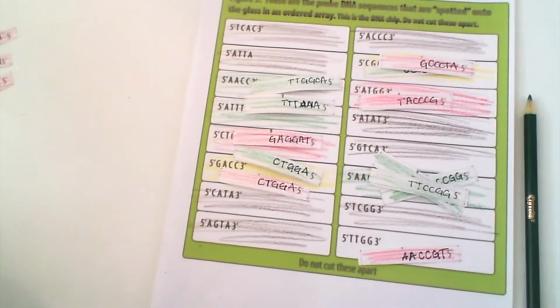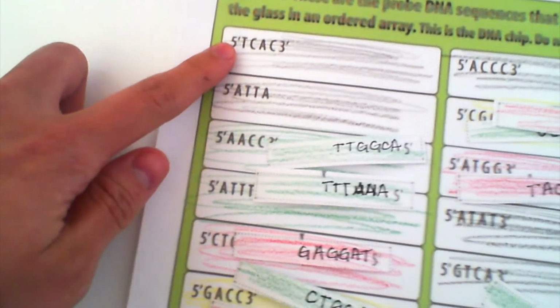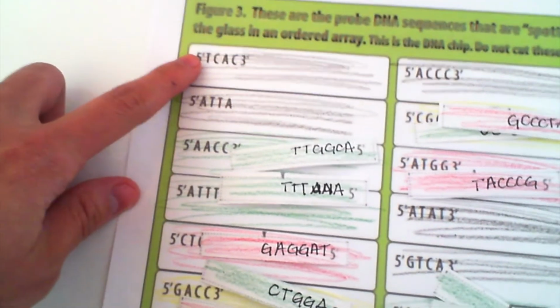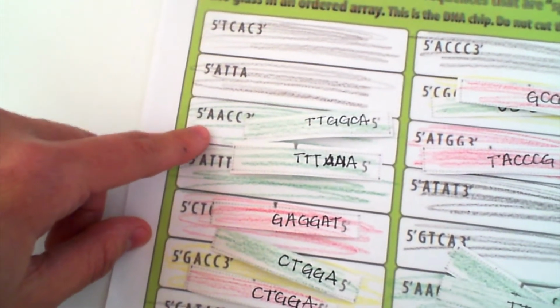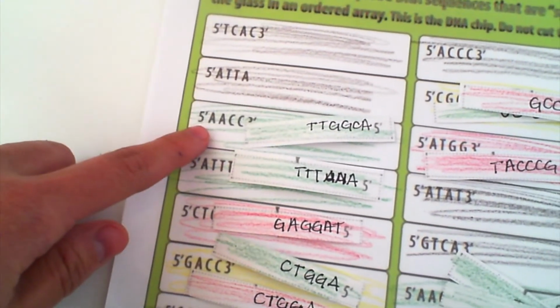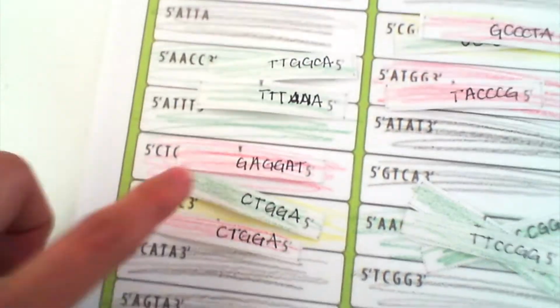How well did you do? So let's go over it. Starting on this side, this gene contained no cDNAs. So we know that the plant with light and the plant with no light does not make this gene. Same thing for this gene. For this gene, it fluorescently shined green. So that means in the plant that was given the sun, this gene is expressed normally. Same thing with this gene, because it was also green, and there's only one cDNA that popped up to it.